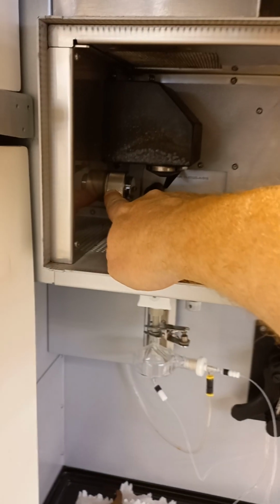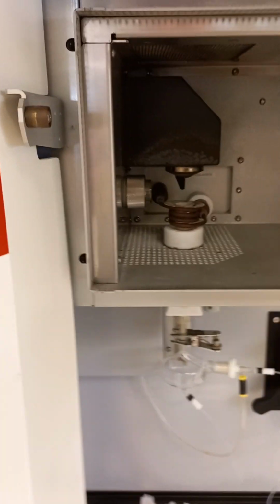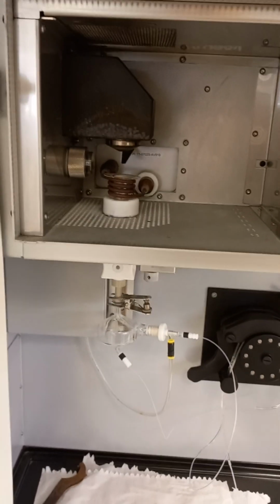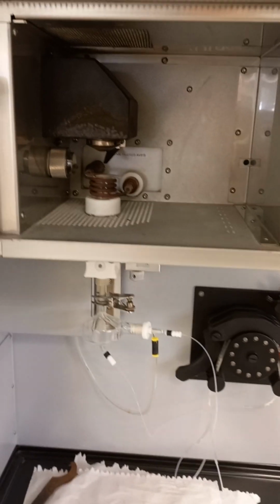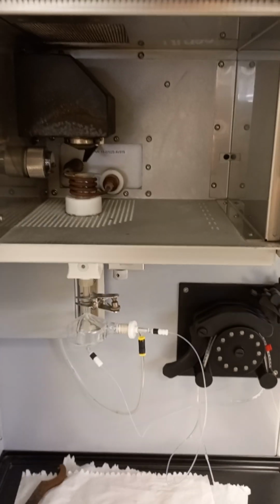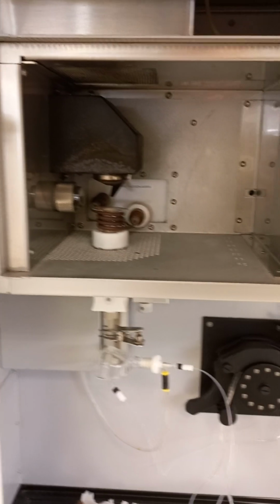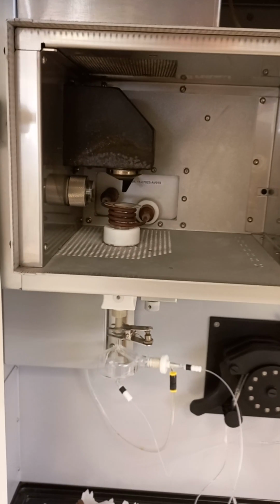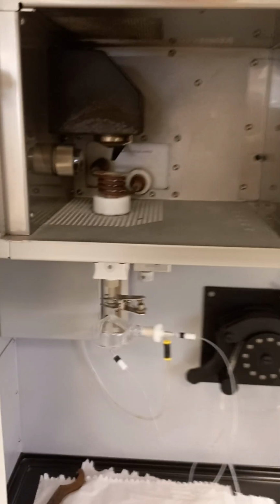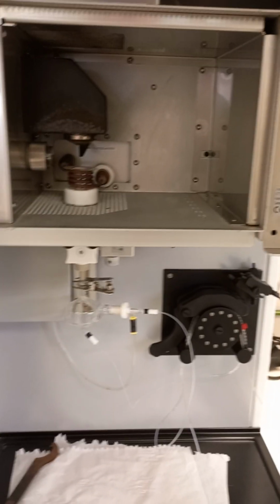And the more classic view, more free of interferences, we have here. For some elements that are specifically important to measure without interferences, but we have high concentrations of these elements in the sample, and sensitivity is not an issue here, we may use, in the same run, at the same measurement cycle, for the same sample, also the radial view. This is programmed in the method.